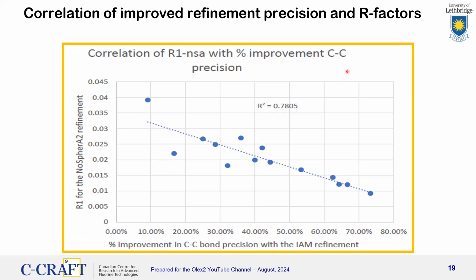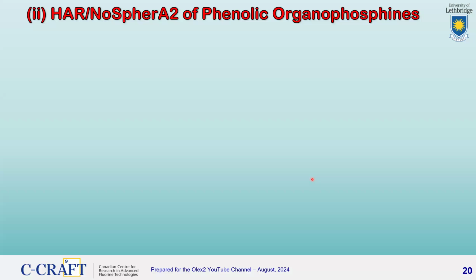We don't have points up here. We don't have points down there or down there. We have no outlier discontinuities, which would suggest that something really weird is going on. We're seeing a general improvement, and moreover, the greatest improvement in precision always comes from the best quality structures. That we thought was a significant discovery.